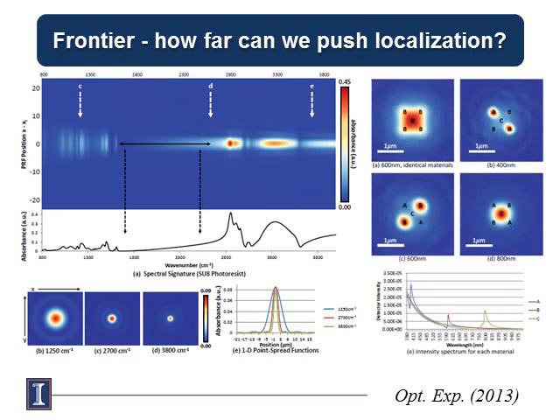Here you see 4 spheres that we've arranged in different configurations. Based on their spectra, we can tell you where the location of the centroid is and what is the spectrum associated with each point scatterer. If you think about this framework, what it tells you is that if you have n species in a given focal volume, you can localize those n species with almost infinite precision if they're spectroscopically orthogonal.